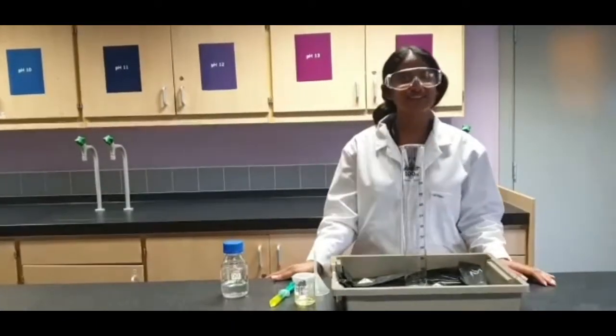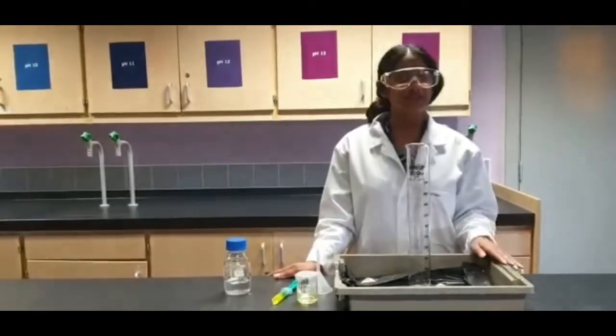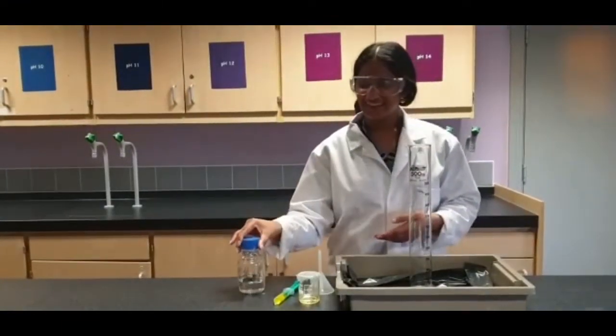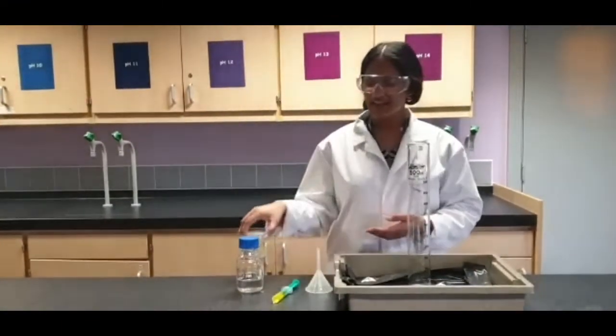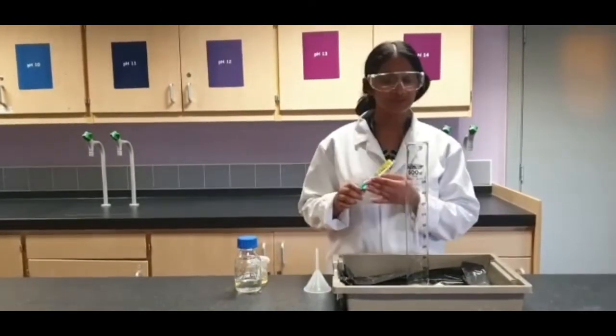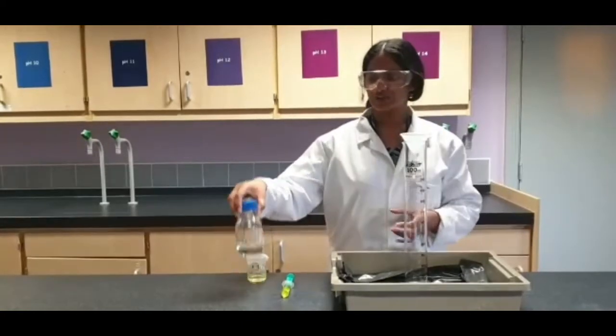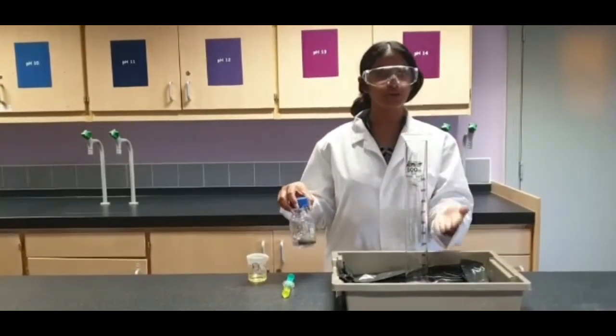Hi, I'm Ms Shaju, and today we're going to make some elephant toothpaste. For this experiment, we need hydrogen peroxide, potassium iodide, and some washing up liquid. So to safely pour in the hydrogen peroxide, we need to place a funnel into the measuring cylinder.